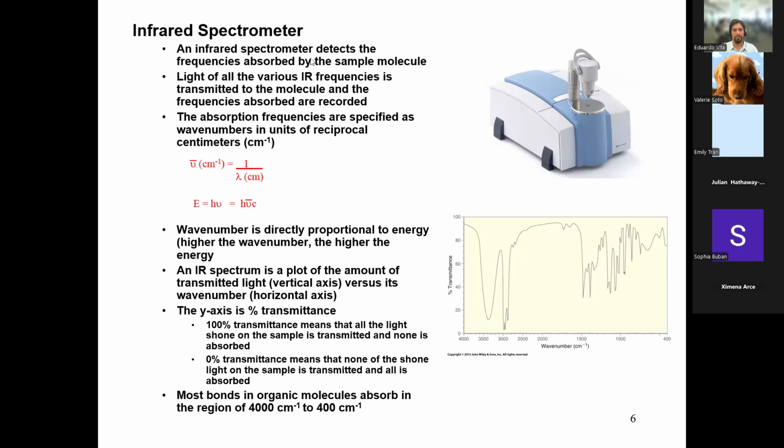Alrighty. So this is the instrument that we use. It's actually in that hallway where we do the TLC UV visualization. Very small instrument. We've done a good job at refining it and making it portable, mobile. What you do is you take your compound and you put it right here. I'm going to use the color orange. It's a very, very small amount.